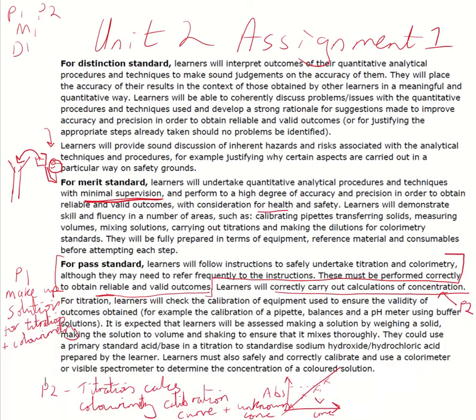So as we can see here, with consideration for health and safety, PPE is very important. You should always be wearing safety glasses and lab coat as well. That is my attempt at a lab coat. Skill and fluency, calibrating pipettes. Yeah, as long as you followed the instructions previously there.